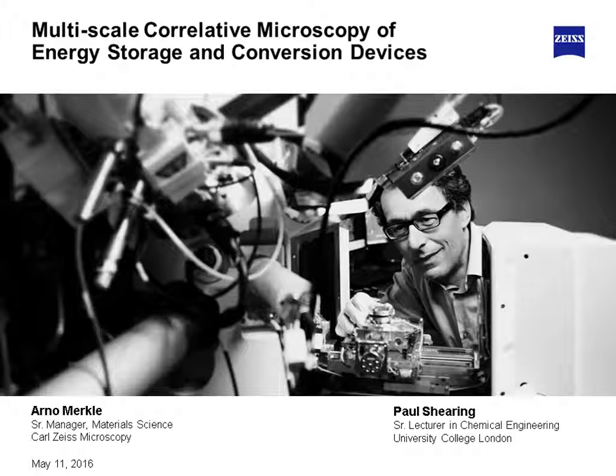For the Ultra, where we're looking at encapsulating air-sensitive materials, again, we've used a variety of different plastics and glasses and PEEK polymer type tubes to encapsulate some of these very air-sensitive materials with some significant success.